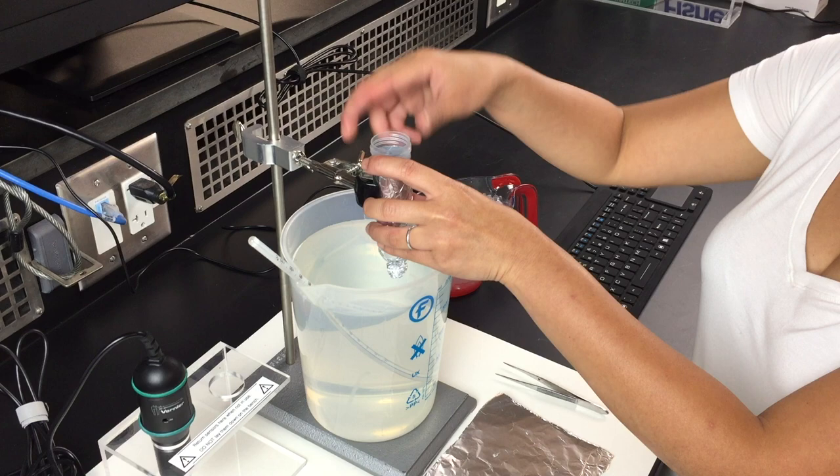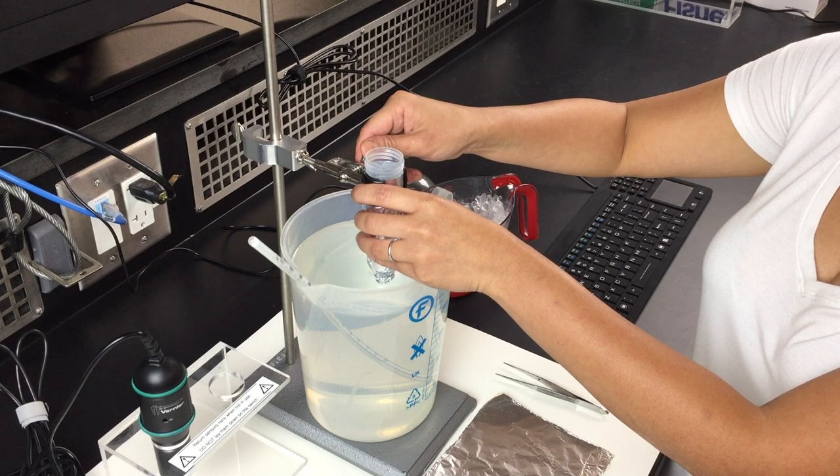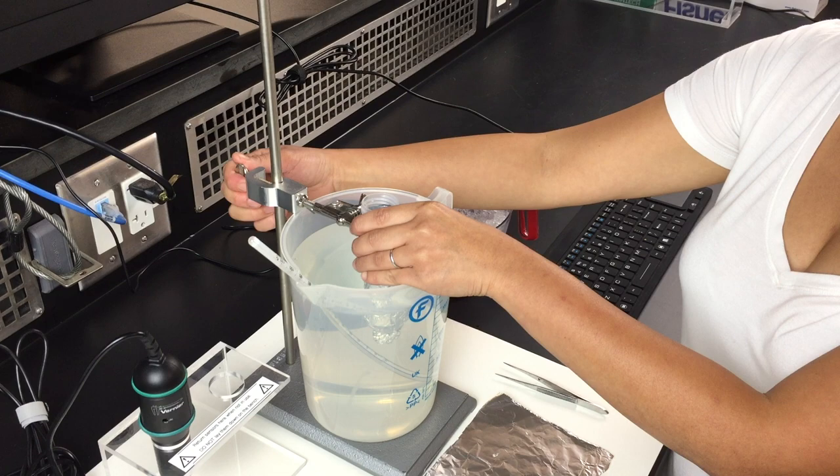Now, you secure the biochamber onto the retort stand with the provided clamp. Tie the clamp at the neck of the biochamber snugly. Lower it down as low as possible to the water bath.